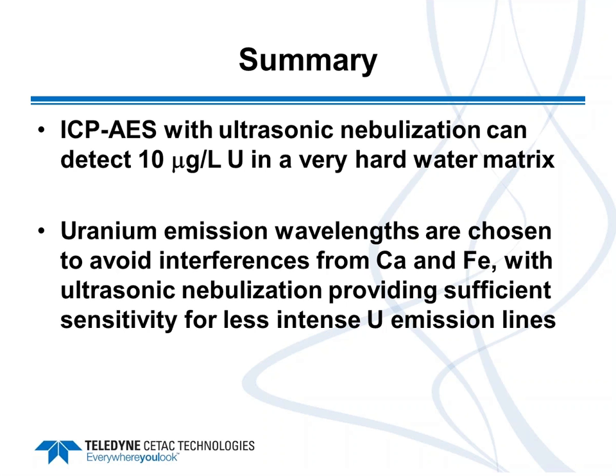In that case, of course, it depends upon the cleanliness of your reagents and your laboratory vessels, everything to achieve very, very low levels. There was one particular application that I can mention was looking for very low levels of platinum group elements, particularly gold. But that has been done with the ultrasonic, probably more so in past years before ICP-MS became very much more sensitive in recent years. Oh, sorry, ICP-MS. Yeah.